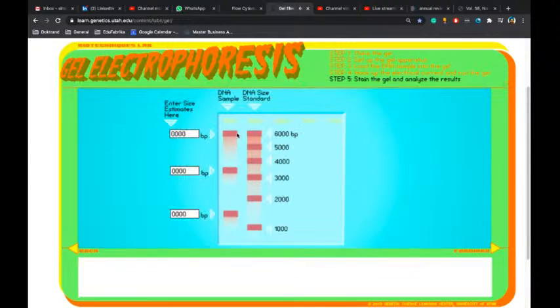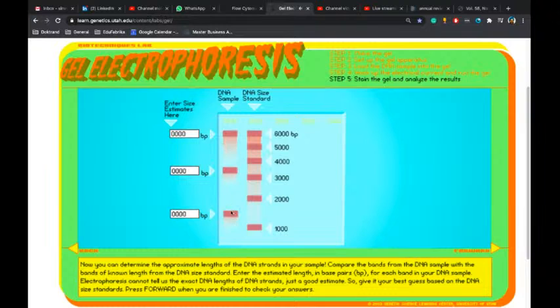So here, how much size are these? So this is the molecular ladder that we have added, the DNA size standard, and on the left, how much do you think these sizes are? So how much on the first one? What do you recommend? Just think about it in your mind. How much will be this one? How much will be this one?